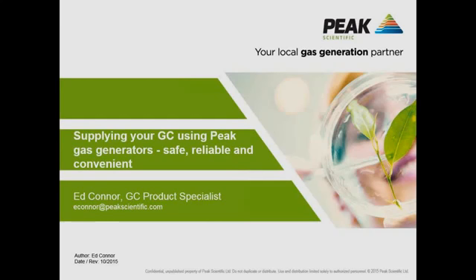And today I'm just going to talk about the use of gas generators for GC applications, particularly focusing on the safety, reliability and convenience of gas generators.